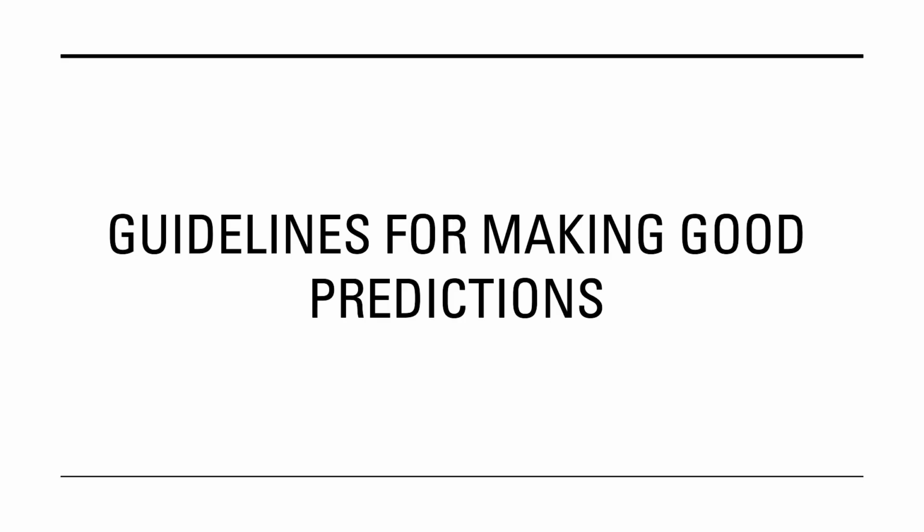A fully detailed overview of the process of making good predictions is beyond the scope of this video. However, the following 4 guidelines will help you to know when to use which methods for different classes of compounds. These simple principles will help you to make better use of DIADEM Elite's prediction tools.